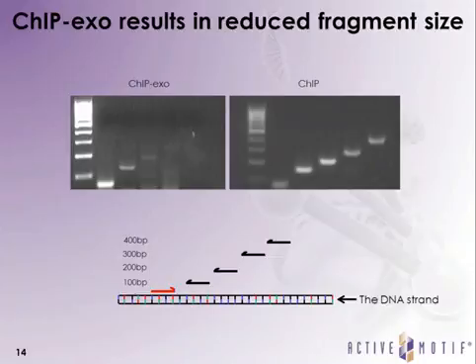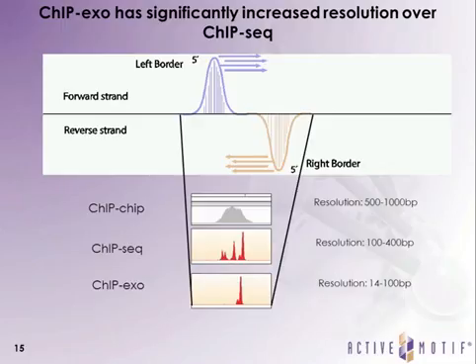So when we go back to our original slide, which we're comparing the different technologies out there, ChIP-Chip, ChIP-Seq, when we get to ChIP-Exo, you have really reduced the amount of reads that are going to happen down to a very concise region of buildup just before the protection point, which we see here. This buildup is where your transcription factor has been bound, protecting it from digestion, and you see it on both the forward and the reverse strand. And the space between these is, of course, where the transcription factor binding site is.